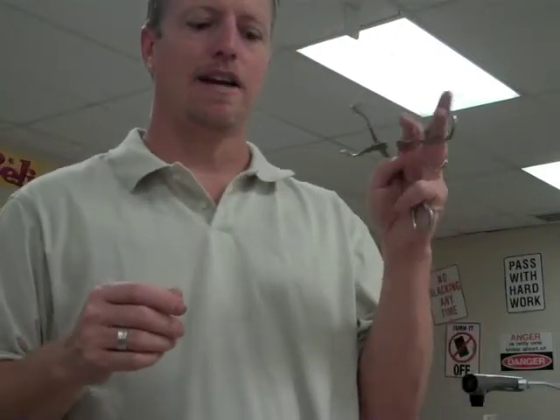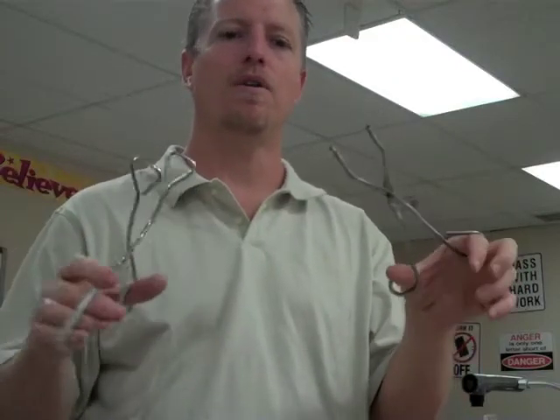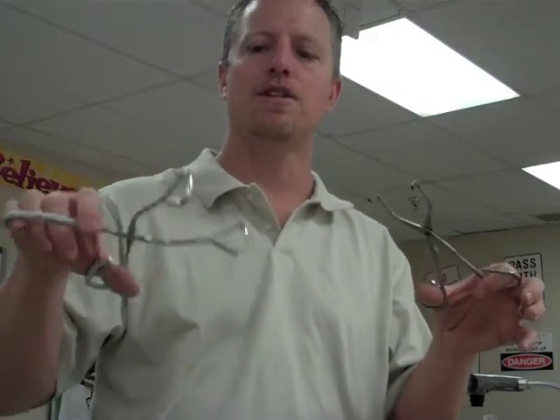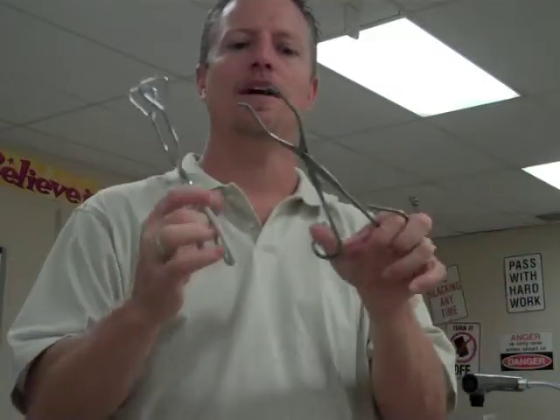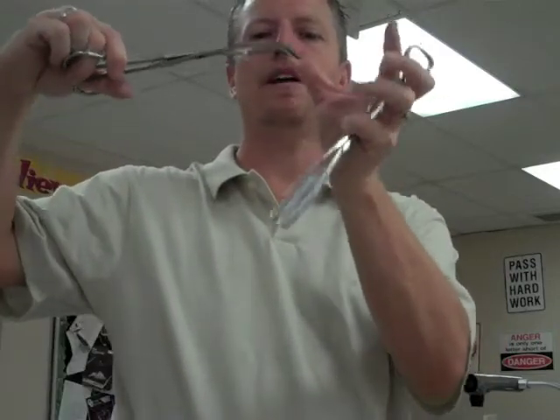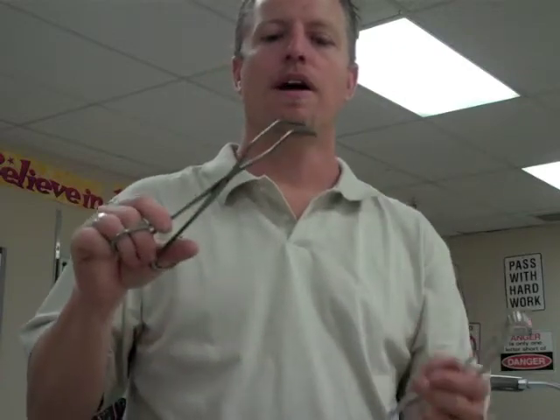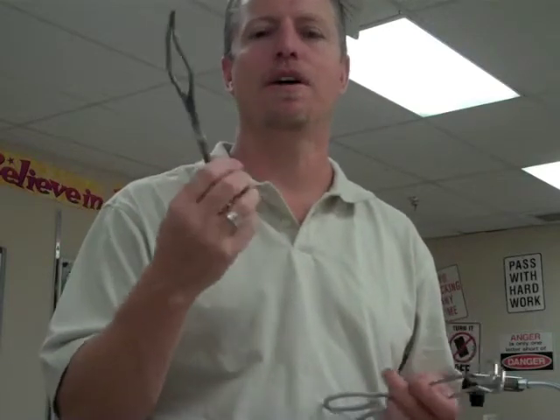We've got two sets of tongs here, and they're both essentially the same thing — both are tongs that allow us to pick up things that are hot or where chemical reactions are happening so we don't want chemicals getting on our hands. This type is actually called a crucible tong. It doesn't have a very wide opening — we clamp the crucible right here and pick it up. A crucible is just a small bowl-shaped ceramic piece that can handle really high temperatures. You just need to know these are tongs; the crucible tong name is more for high school.